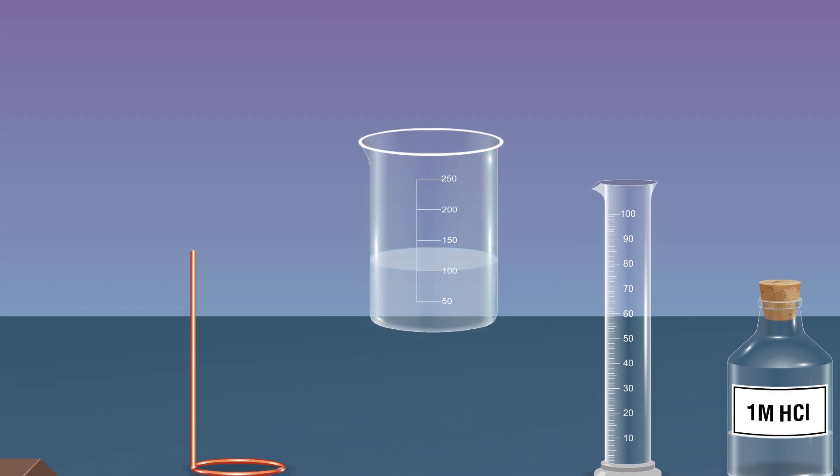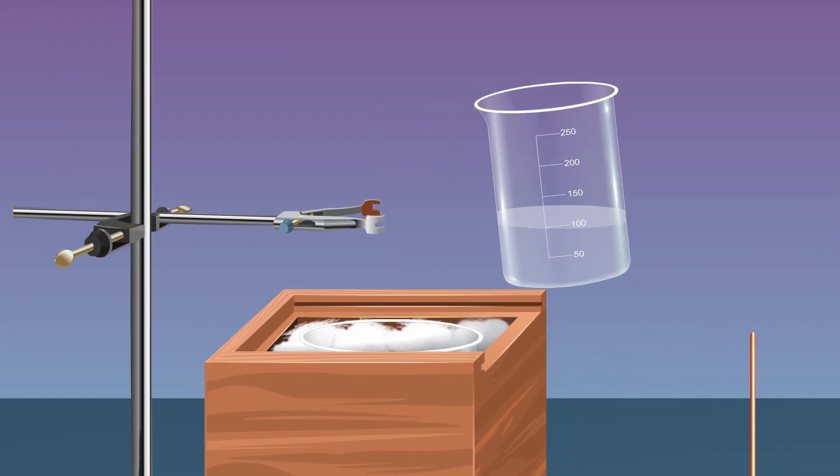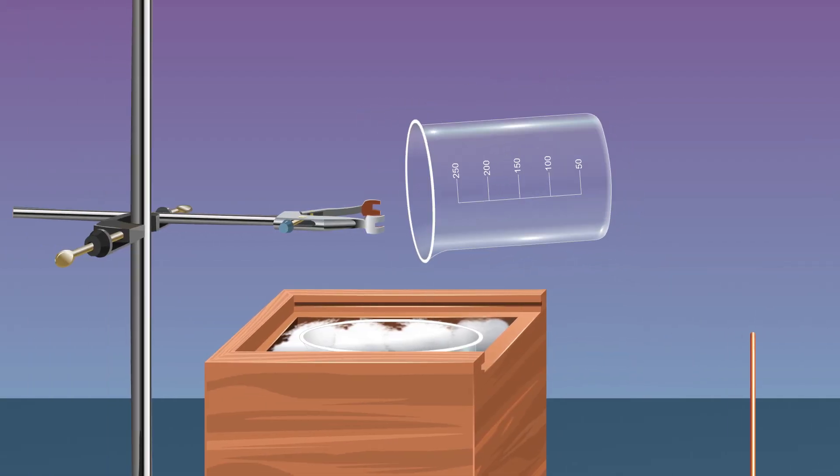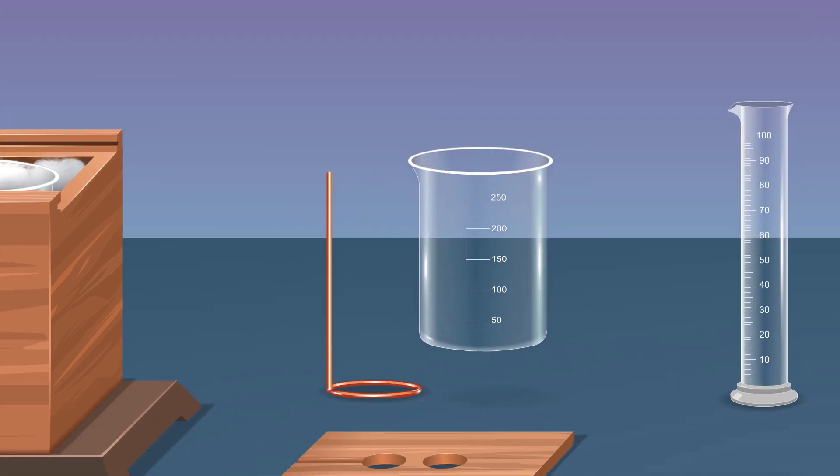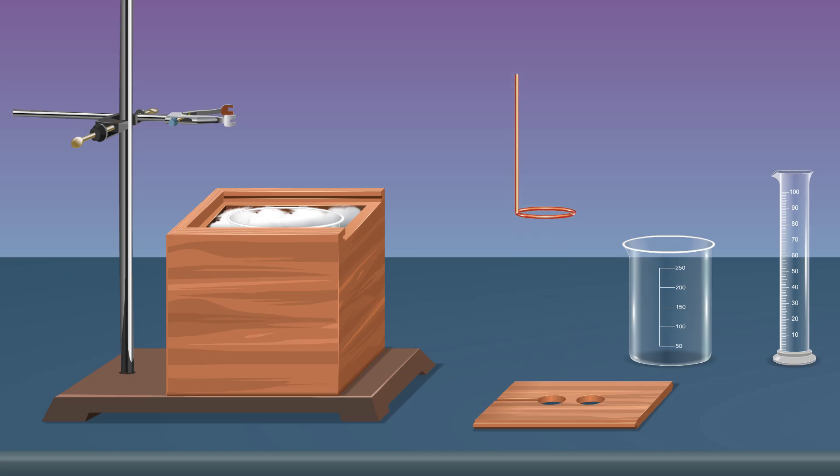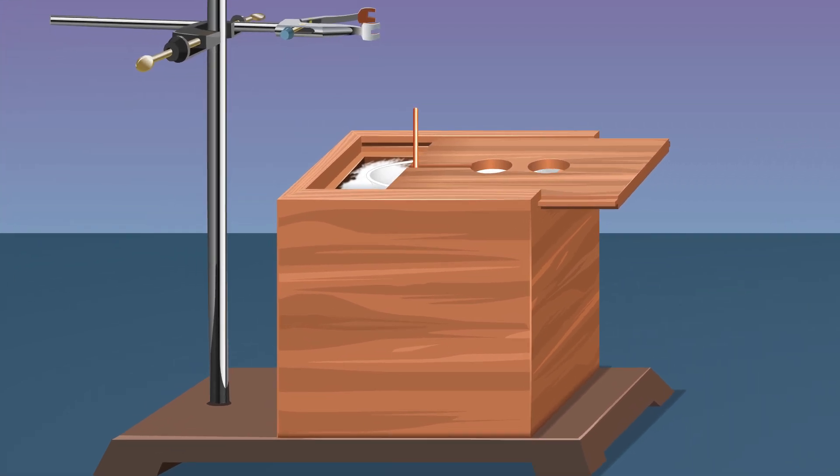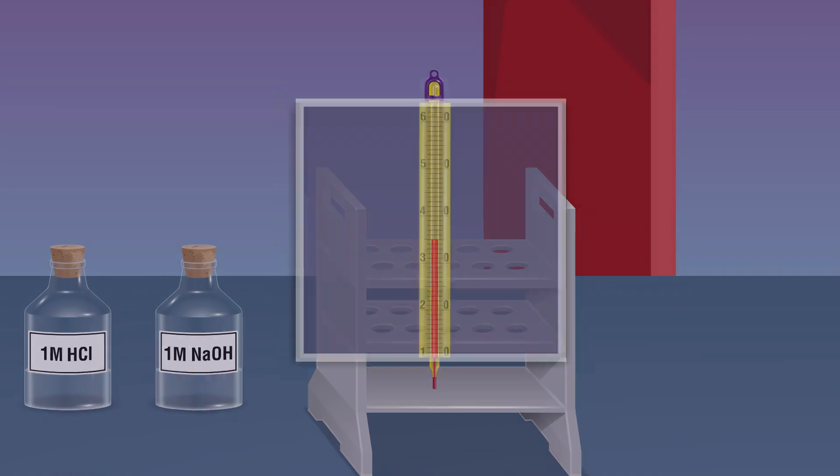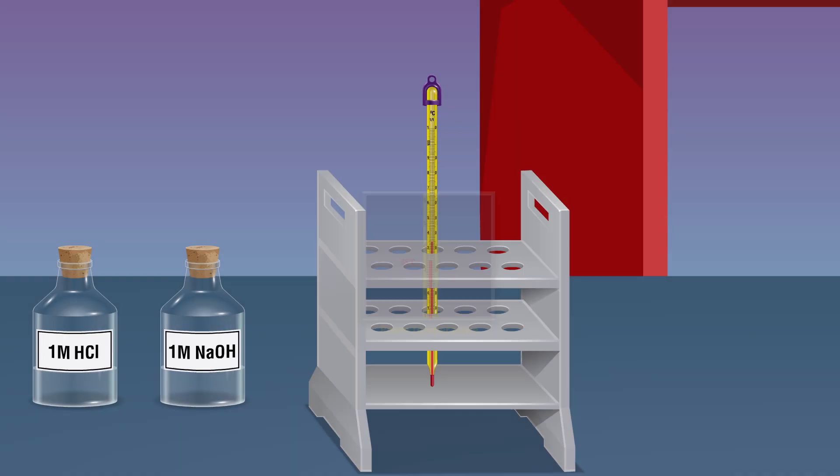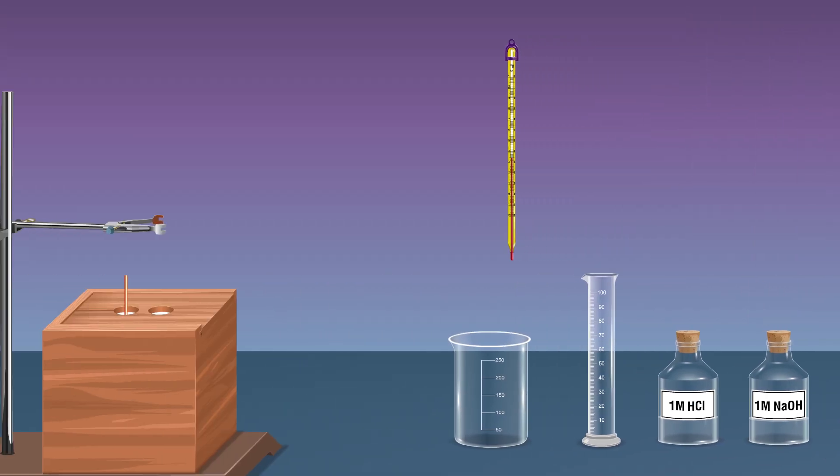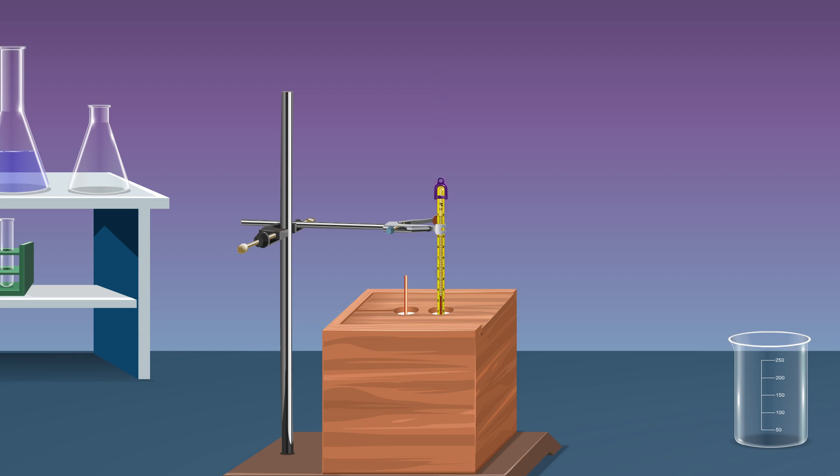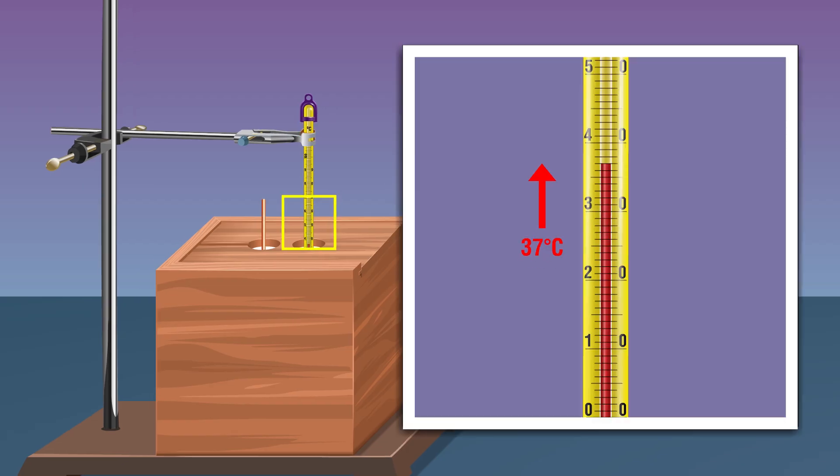Pour the sodium hydroxide solution into the calorimeter that contains 100 milliliters of HCl. Place the stirrer inside the calorimeter, close it, and stir the mixture well. Measure the maximum temperature of the reaction mixture and note it as the final temperature T2 degrees Celsius.